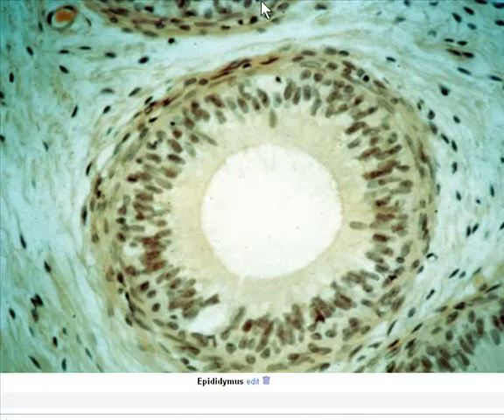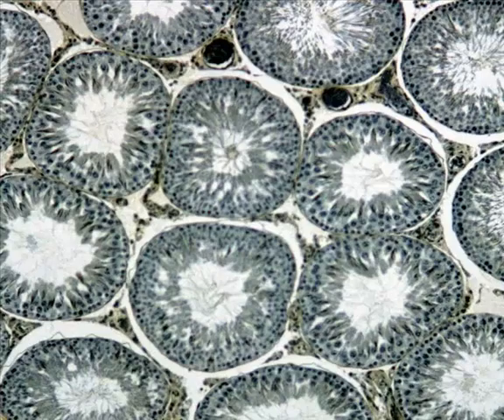For the male, we've got two slides. We've got the epididymis and then we have the testes. The epididymis is the comma-shaped storage organ that is on top of the testes. And when we look at them, commonly this is a pink or purple stained slide, and it has a fairly clear lumen to it, a fairly open lumen. You may see microvilli, so it may have a somewhat fuzzy border if you really zoom up on it on high power. But the main part of the lumen, the open space in the center, is pretty open and clear.